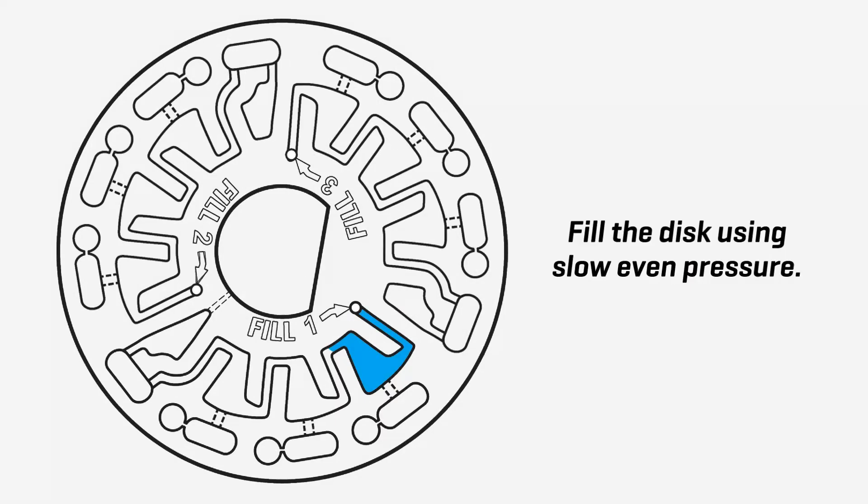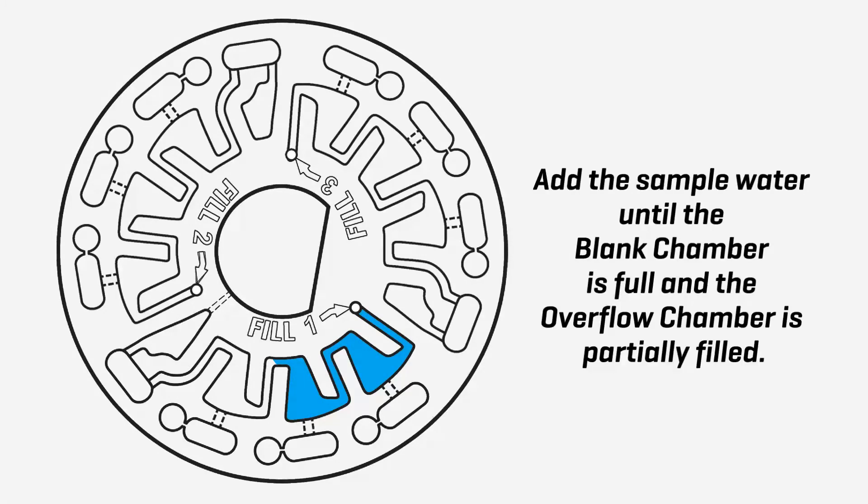Fill the disc using slow, even pressure. Add the sample water until the blank chamber is full and the overflow chamber is partially filled.